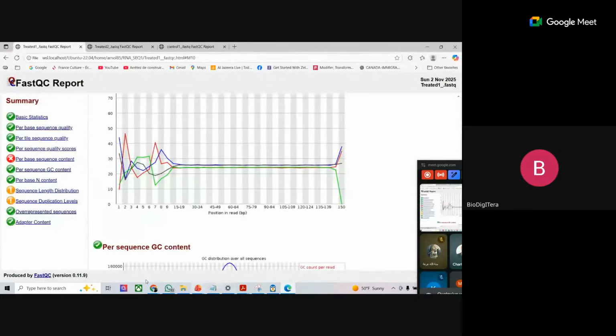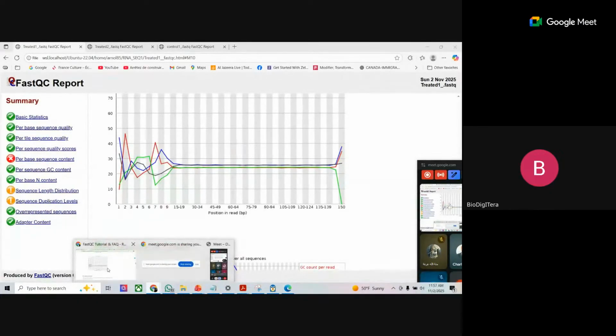You must explain the 8 other parameters. We explained 1, 2, 3, 4. I want you to explain the other parameters here, and you send me that by email on Wednesday.